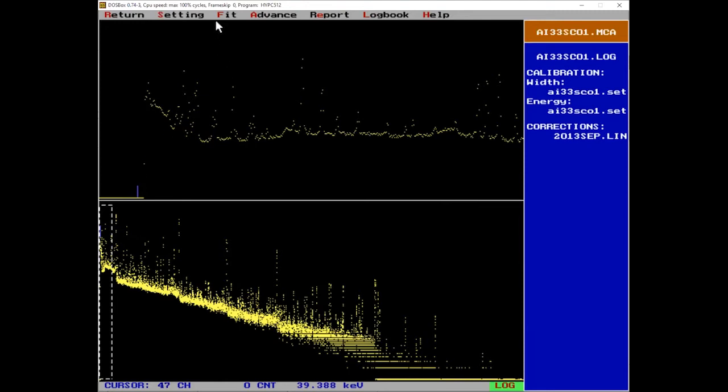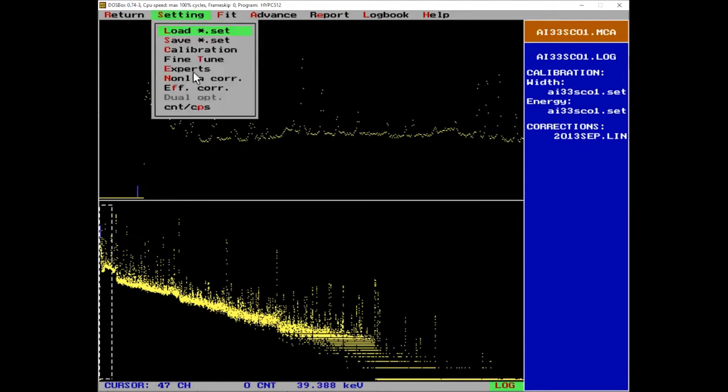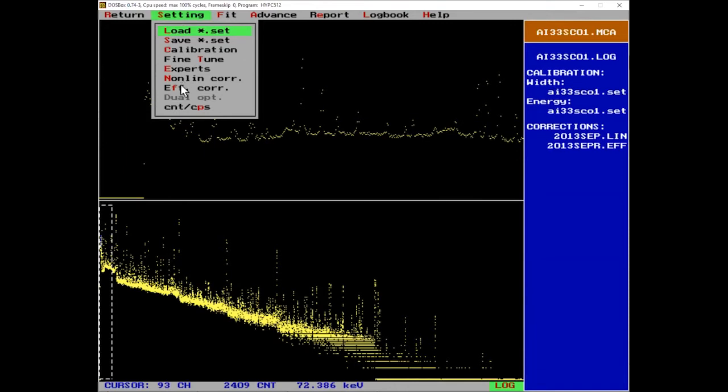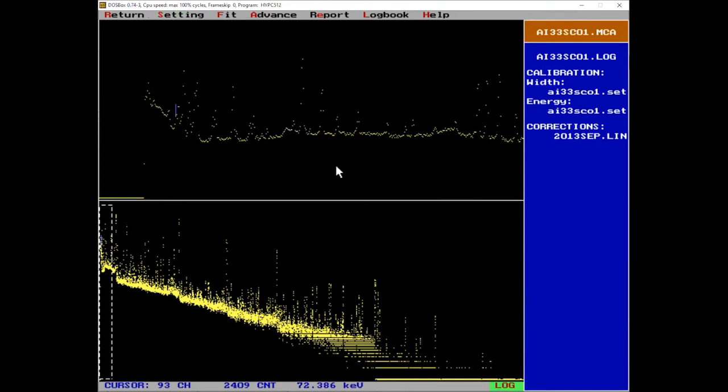And then the next step is I can optionally load efficiency, but my personal preference is that I like to have it switched off. We can load it anytime, and then the results will be recomputed.